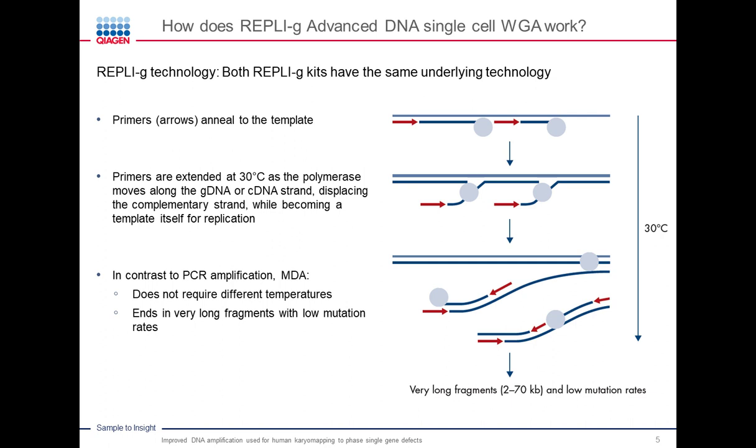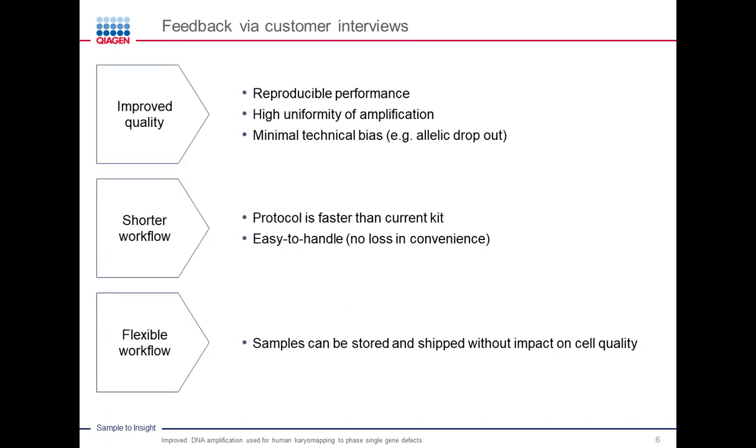So the product of this MDA amplification can be fragmented for short read sequencing. It can be used directly for PCR analysis, or it can also be used for long read sequencing.